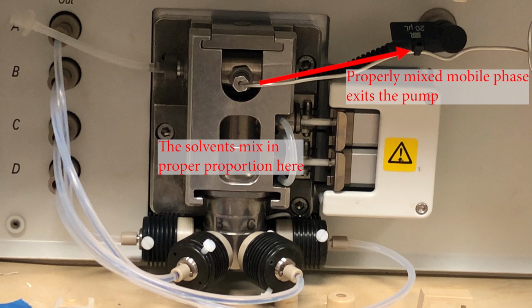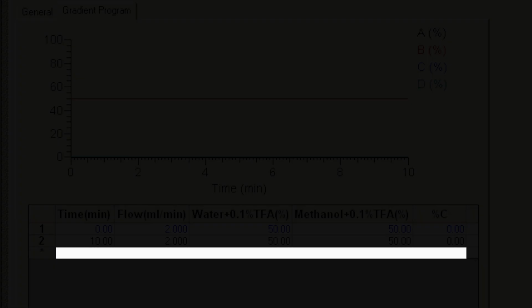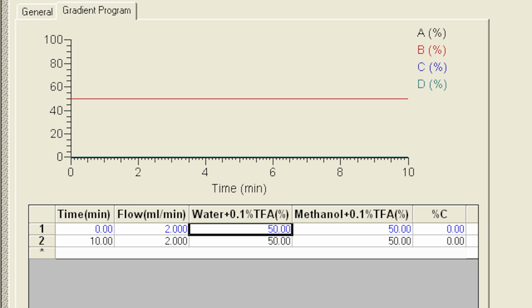And this turns out to actually be really important. This is our mobile phase. Whatever comes out of here, whatever exits this mixing chamber is our mobile phase. But we can change the composition of our mobile phase. Usually we're going to run A and B solvents, and it's really simple for us in the software to just change the percent A and percent B and change the chemistry of our separation. So that's going to be an important part of the method, which we can change in software.